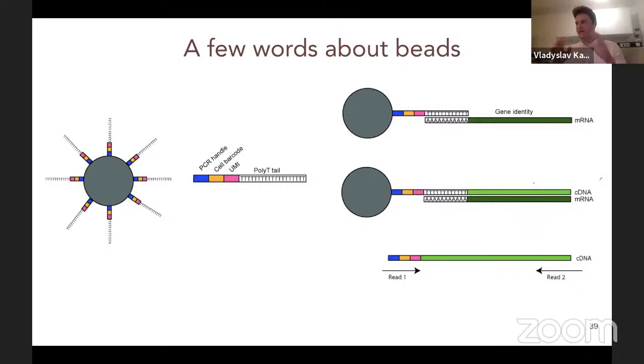So we can separate quality control into three major topics. The first quality control, as Marina said, would be the pre-processing of tissue. You can, for example, FACS your cells and use some viability dye reagents to see whether your cells are dead or not. That would be the quality control in the pre-processing step. When you are talking about the DNA library preparation, most quality control steps target the DNA concentration and the bioanalyzer results, whether you have some contaminations from other DNA lengths or not.